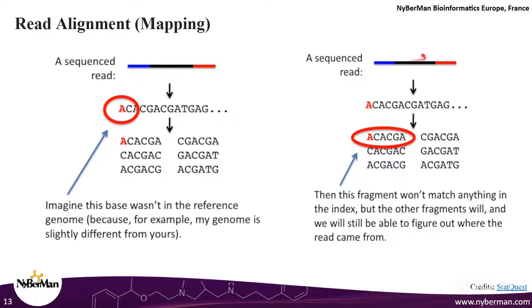Somewhere in the middle, this read would have mapped, and this tool, which is STAR or HISAT, etc., which performs the alignment, gives us the information that from this position to this position, this read has mapped. Now imagine you have this for all your 20 million reads in your experiment per sample.